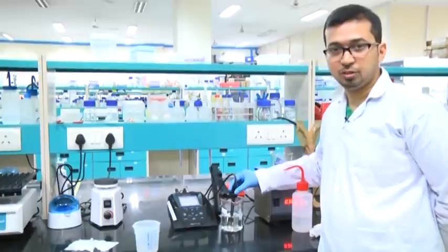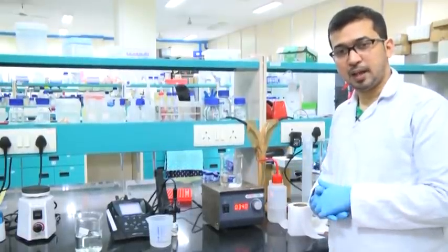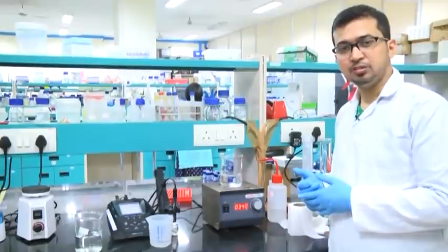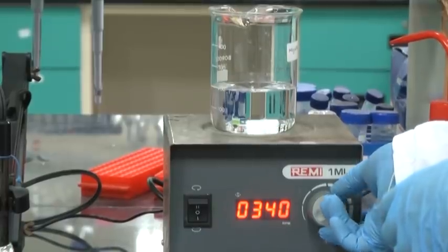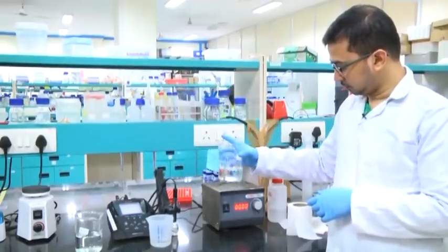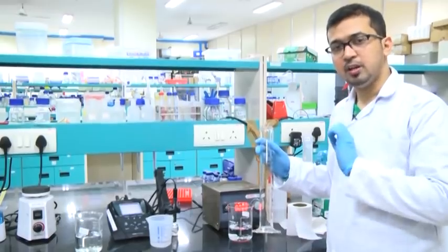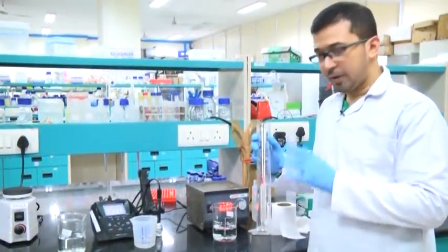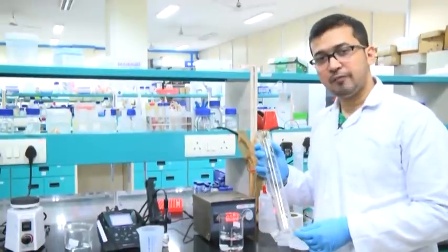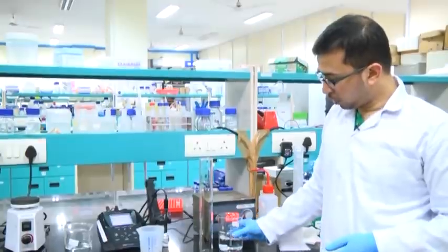Now we will see the pH for the dibasic solution. Here we can see the sodium phosphate dibasic solution is almost clear and the solid components are dissolved. So we can take this solution for volume adjustment — up to 250 ml. For that, lower the speed of the magnetic stirrer and switch it off. Take the solution in a clean graduated measuring cylinder, the same way as done previously for monobasic.